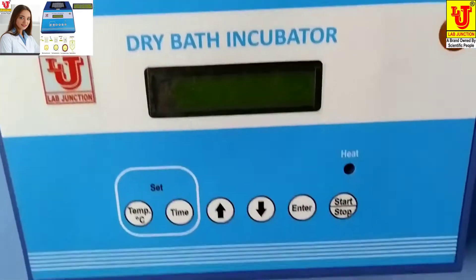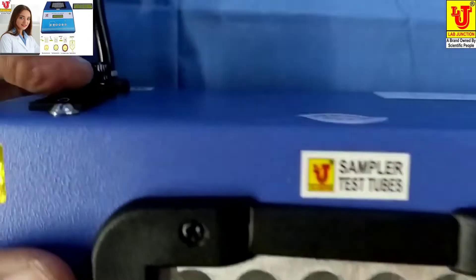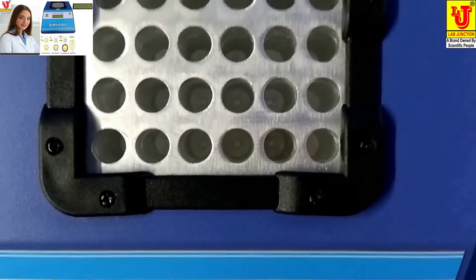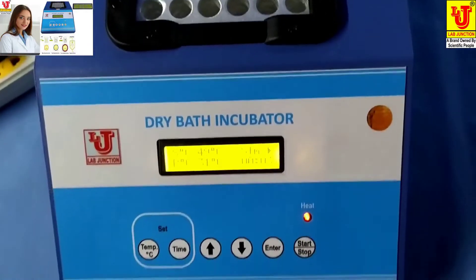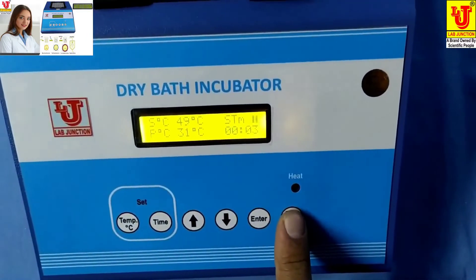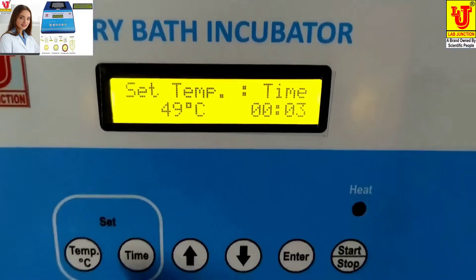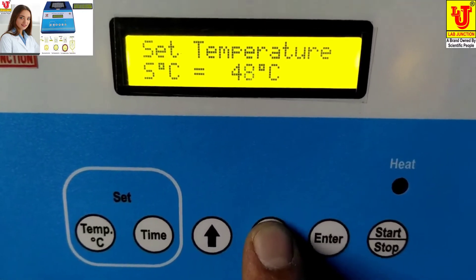How to use this dry bath incubator: switch on the instrument. These are the racks for placing test tubes. First, you have to set the temperature. For example, I am setting the temperature to 37 degrees.